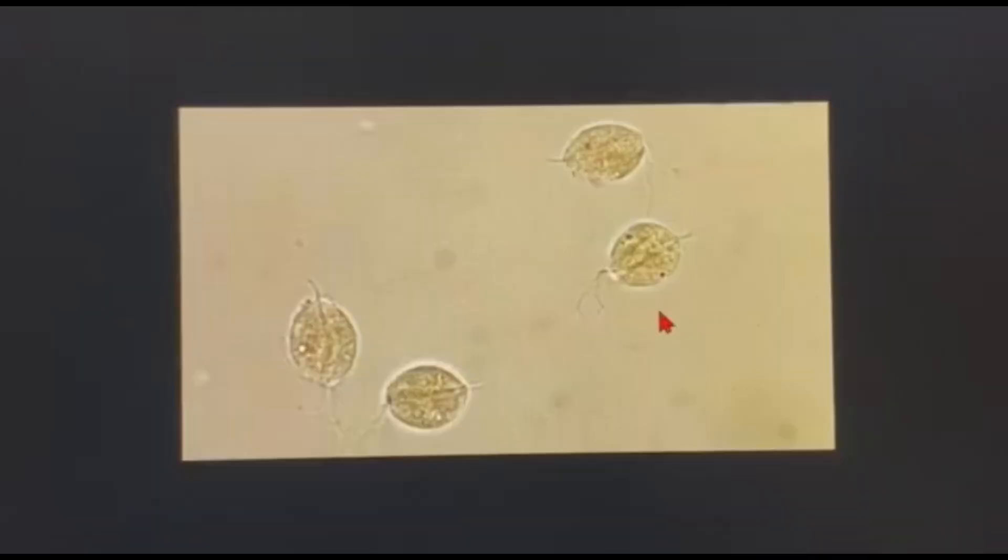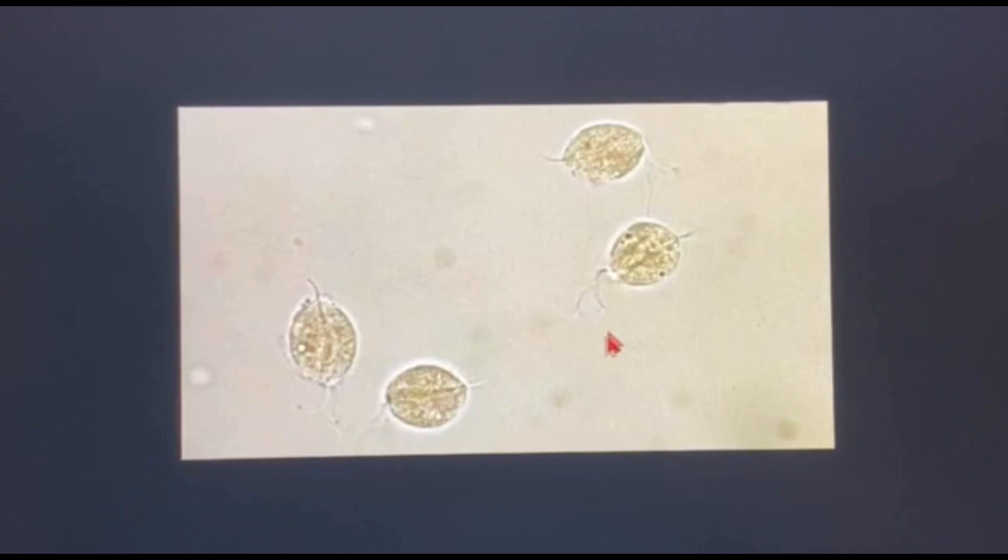This is how it appears in a wet mount. You can see the flagella or the undulating membrane here. You can see the body which is not like the racket-shaped as in Giardia. And yes you won't find the scary eyes, aka the nuclei here.